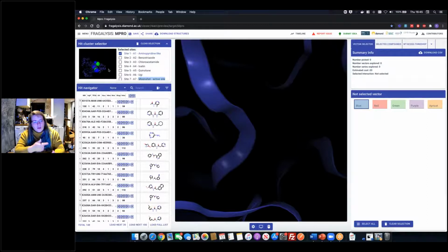If you had a crystal structure that had a ligand crystallized in multiple positions, before we upload that data to Fragalysis, we separate those ligands out. In Fragalysis, we treat the protein and ligand in isolation from each other, so that we can work on the ligands on their own or together through some of the visualization options.